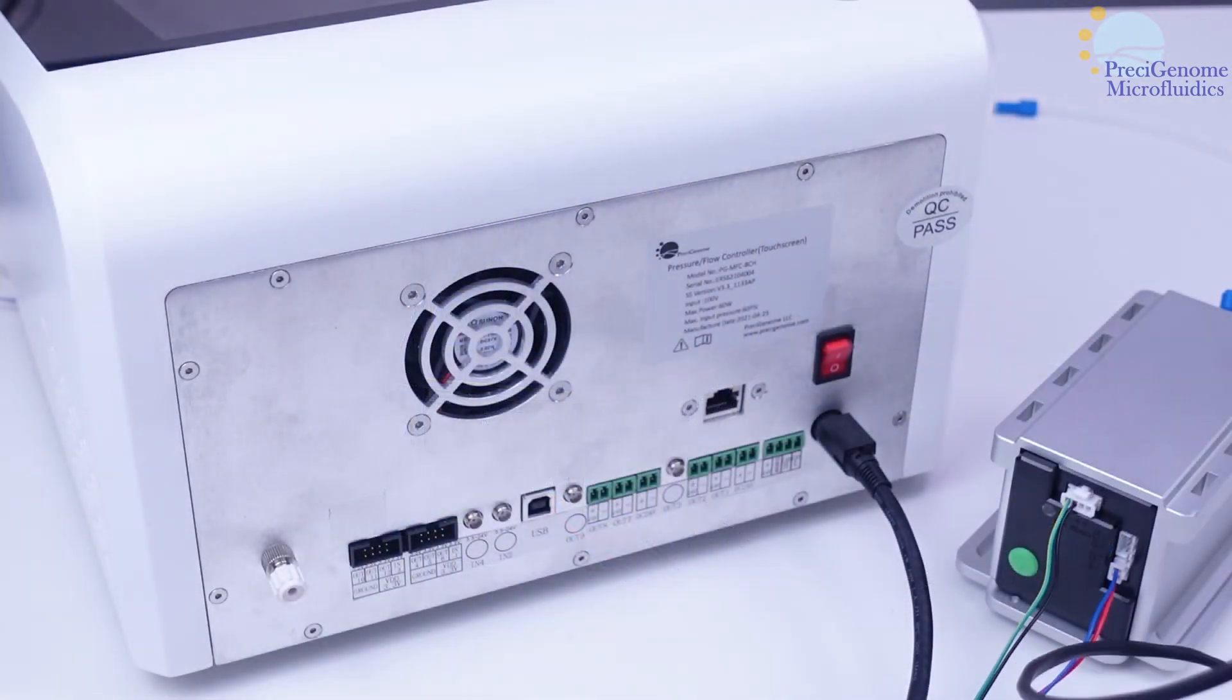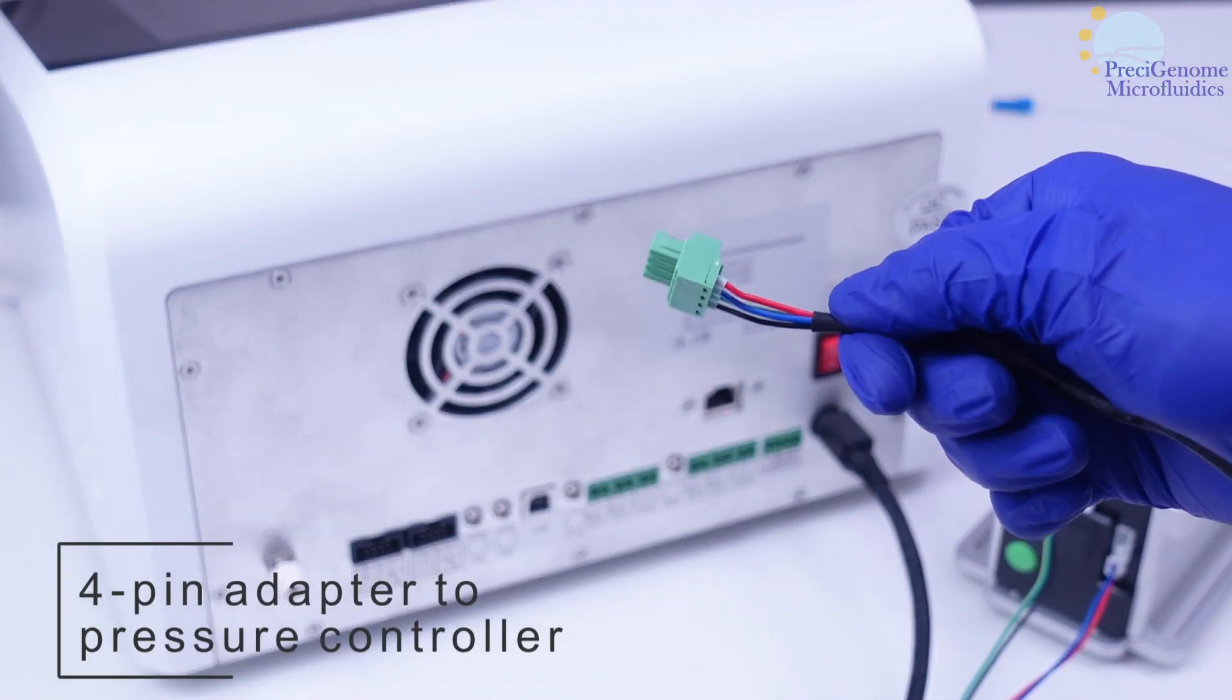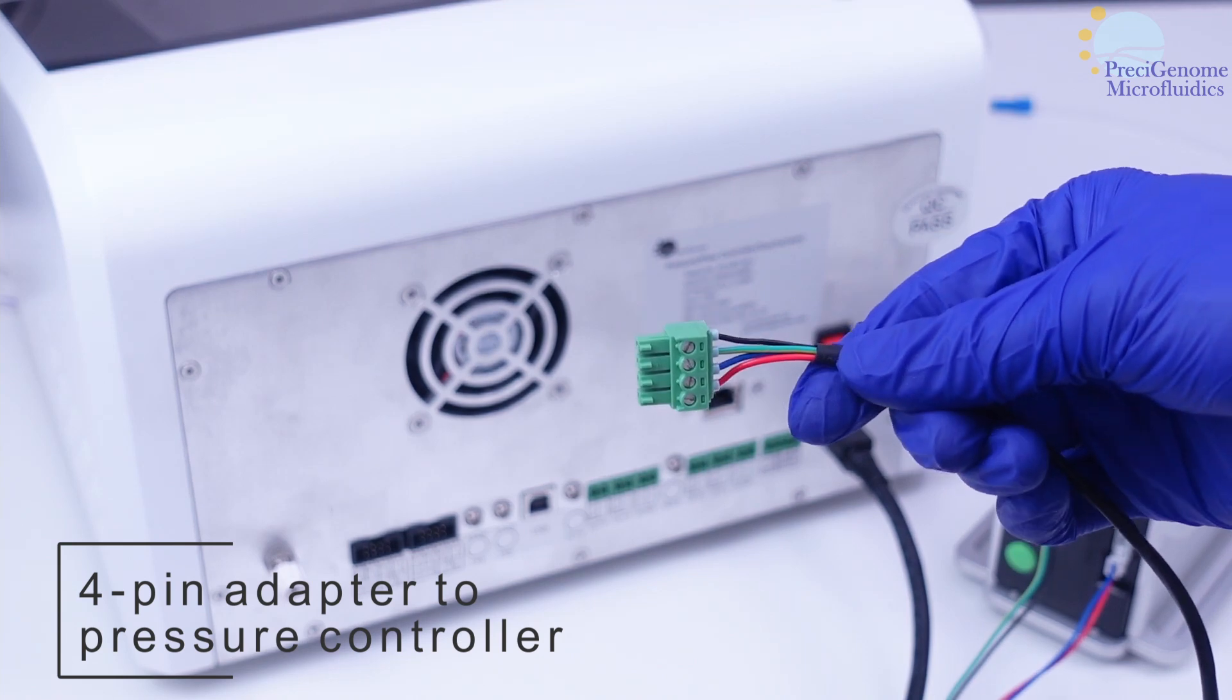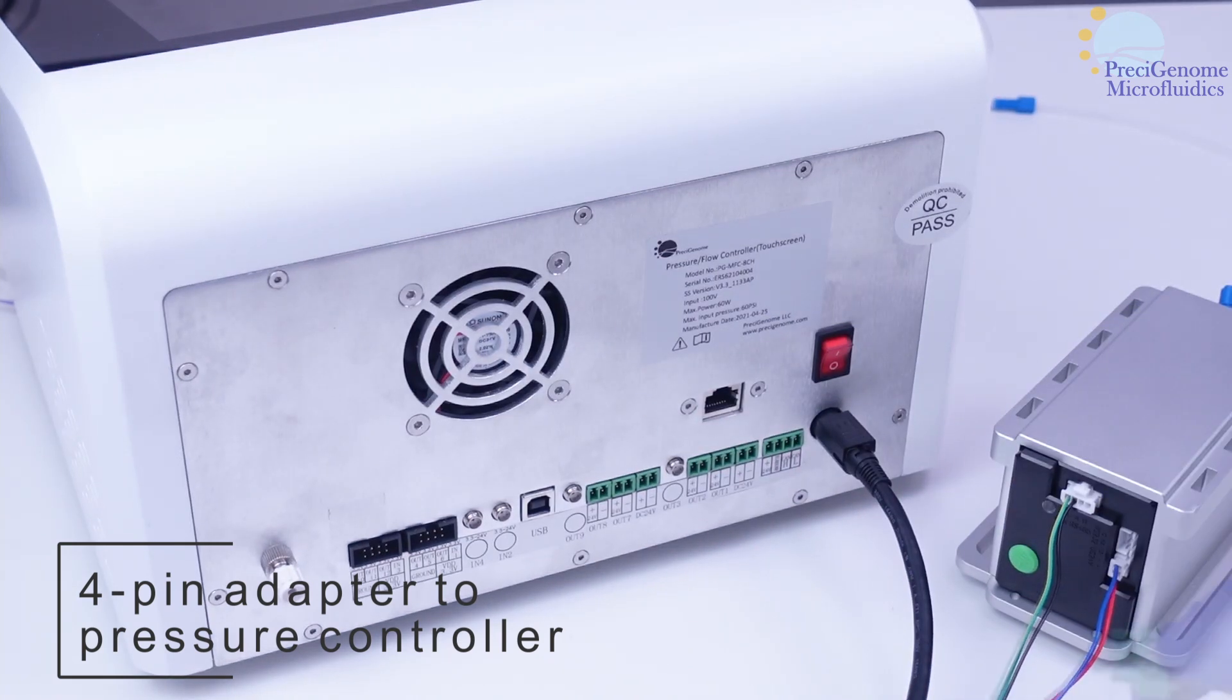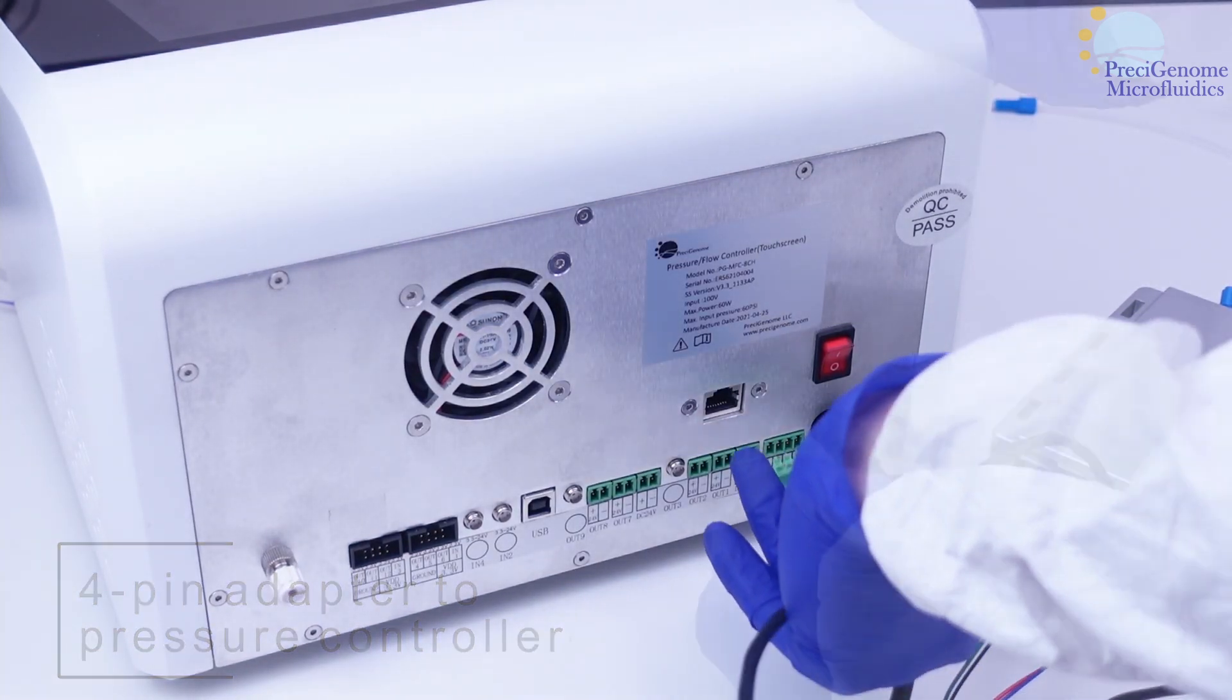These two connectors end in a four-pin adapter which we can plug into the pressure controller.